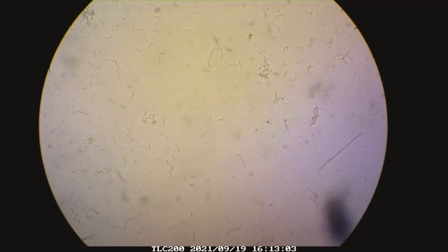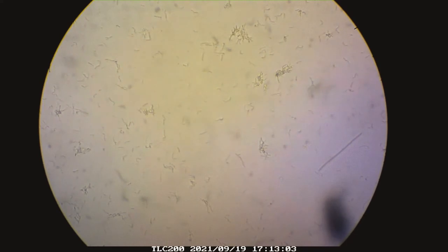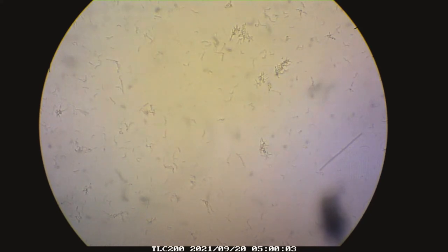And this is what I got for a 24-hour time-lapse. Here you can see some bacteria growing - they just get longer and at some point divide into two.